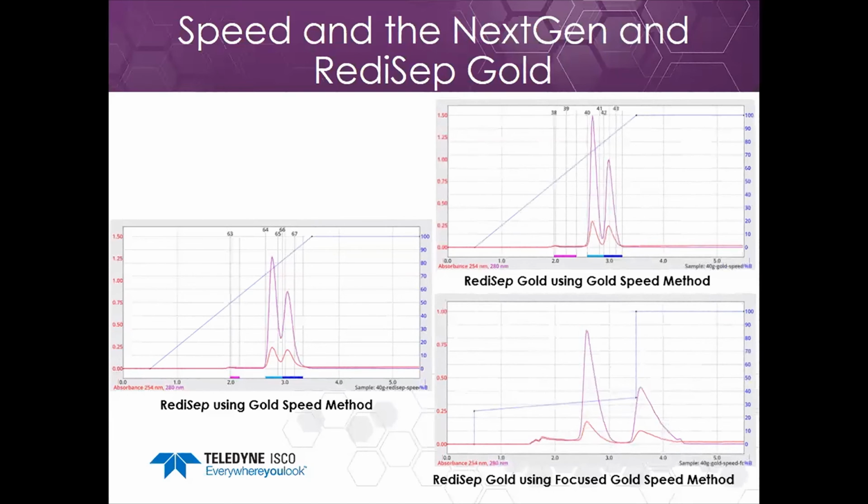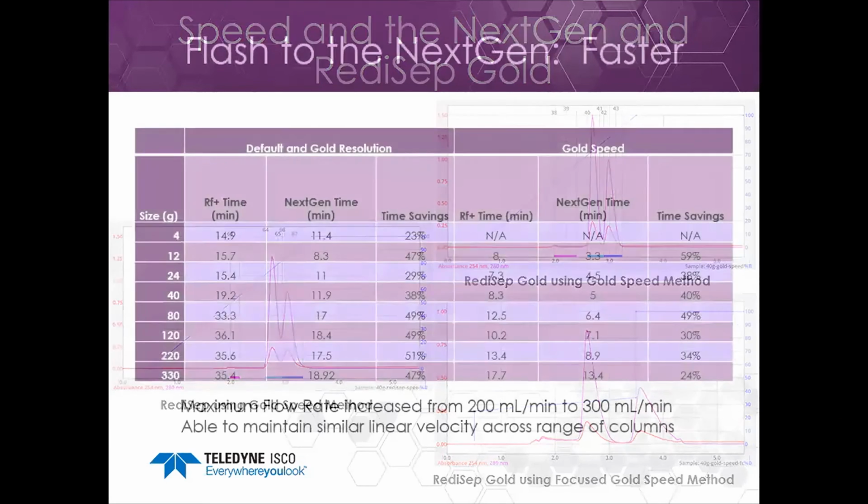Additionally, we're able to actually increase that baseline separation by using a focused gradient. So using that same RediSep Gold column, we focus the gradient from 25 to 35% there. And so the peak shape is a little bit different because we're not using as strong of a %B in our method, but we're able to get baseline resolution in the same amount of time. So we could actually load a little bit more compound maybe. And we have solvent savings from using this method, and time savings obviously too.